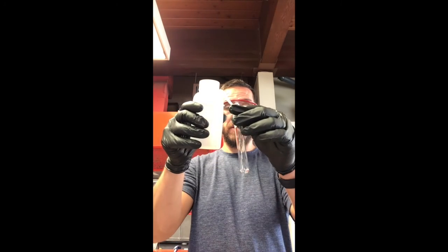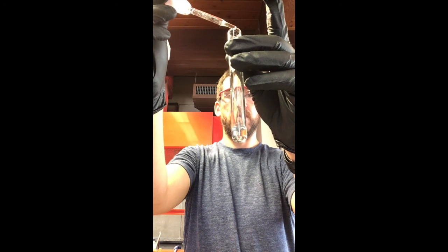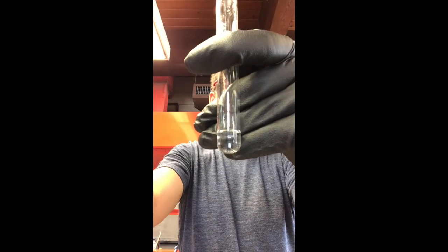So let's take a look at number 2. We'll squirt a little bit of DI water in there, and now we're going to squirt a little bit of unknown 2 in here. Okay. Now I'm going to do it slowly. Drop, drop. Let's do the glove thing again. Drop.